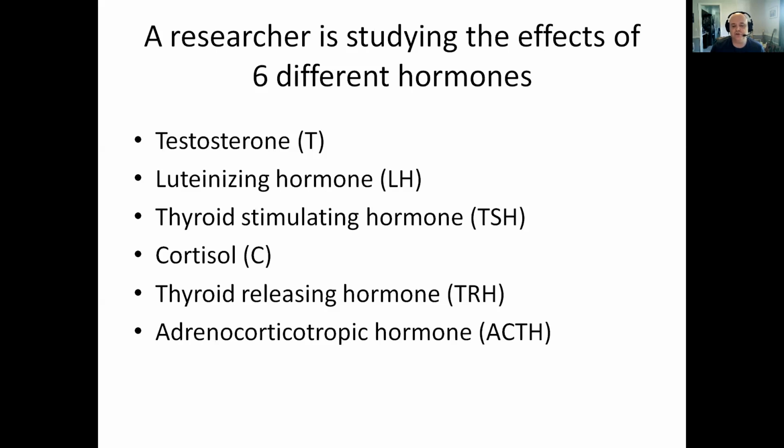Okay, to do this lab properly, you're going to have to know what each of these hormones actually do, and I will not be covering that in this video. Okay, I will cover a little bit on a couple of hormones, but that's not the goal of the video. The goal of the video is to inform you and orient you to the task of completing this lab. Okay, all right, so those are the 6 treatments, and of course, if we have treatments, we need a control.